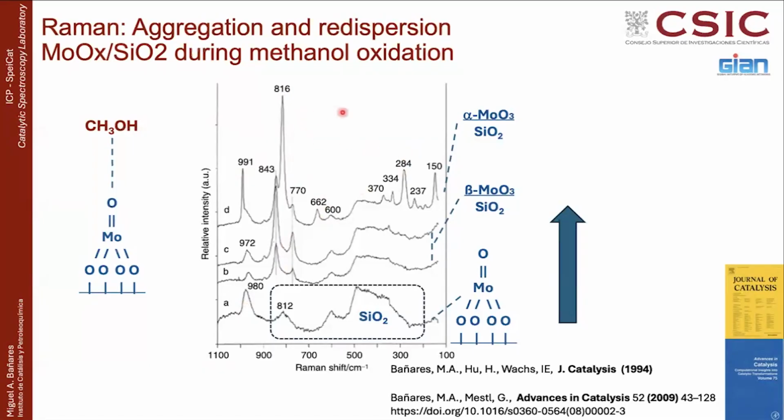So things are really affecting. The catalyst is changing. We are not doing operando yet, but we already see that if you make in situ studies during reaction, you see how the reaction conditions are changing the catalyst, and things start to look different.